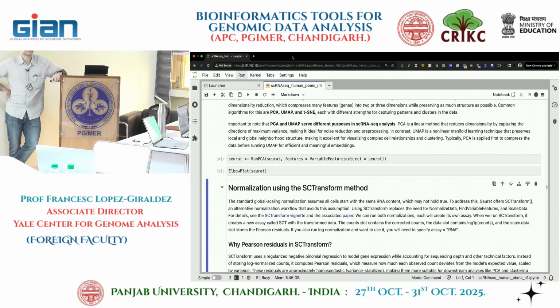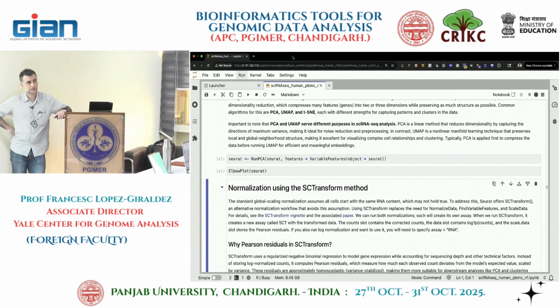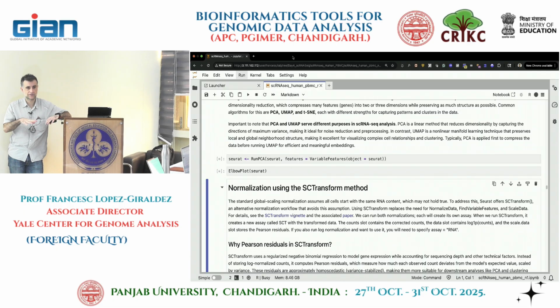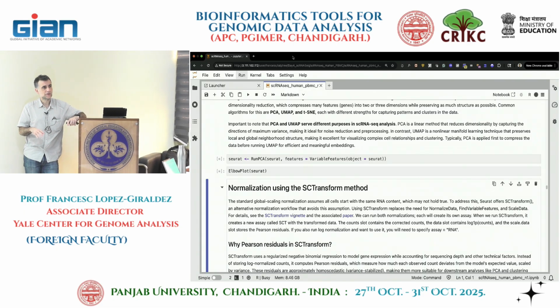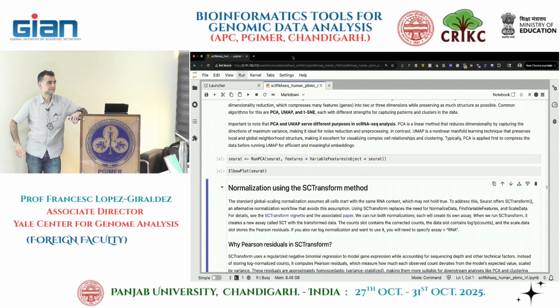Oh, it's on? Okay, good. I was just checking. Internally, it may be parallelizing the process, meaning that if it can, it's going to divide into multiple jobs. So even if our cluster has 100 CPUs, some of us may use multiple, not just one. So it may be slow for some people. You got it too? Okay, so people are finishing. Good.